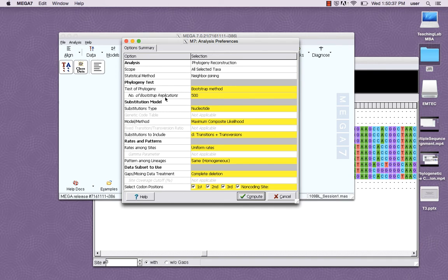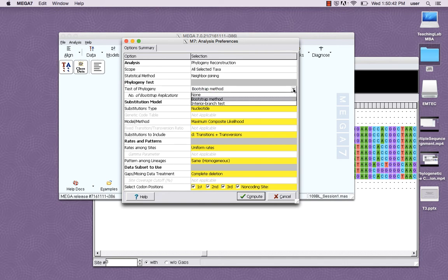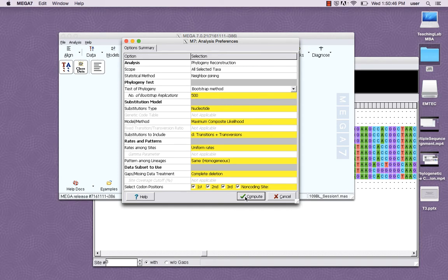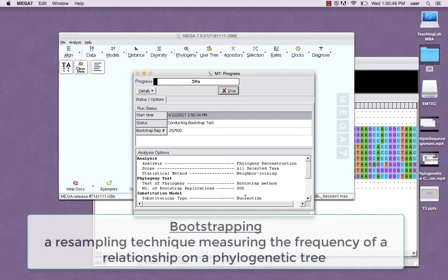Pay attention to the test of phylogeny, which should be set to the bootstrap method, as well as the number of replications, which should be set to 2,000, but for your preliminary tree, 500 will save you some time.